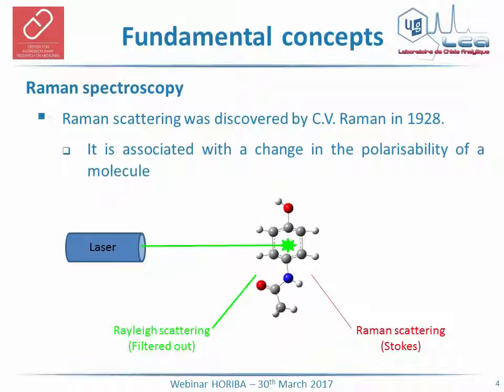The Raman scattering is designated as Stokes-Raman scattering when the photons are scattered with a lower energy after the interaction with the molecule. In the last decades, Raman spectroscopy emerged as one of the most powerful techniques in analytical sciences due to its numerous advantages, such as its high molecular specificity, its ease of implementation, and its non-destructivity.